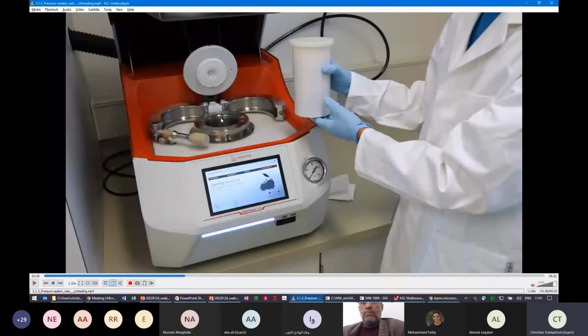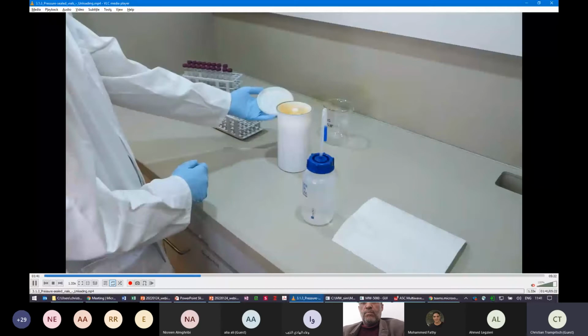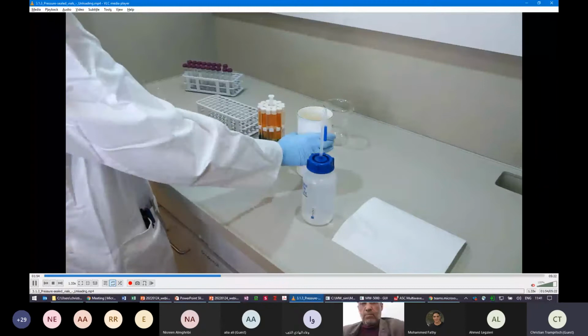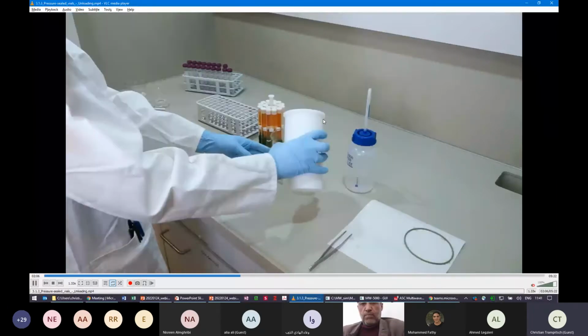And then you carry the liner again into the fume hood. You take out the rack from the load solution and put it again on the drip cup. The vessels are moist outside. So what I do is I take the paper and, okay, forget about the removal of the O-ring. We can do that later. What I usually do is wipe the vials off.